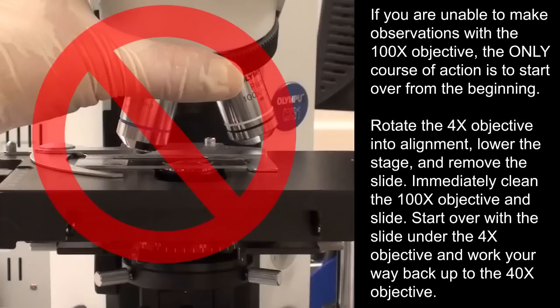Rotate the 4x objective into alignment, lower the stage, and remove the slide. Immediately clean the 100x objective and slide. Start over with the slide under the 4x objective and work your way back up to the 40x objective.